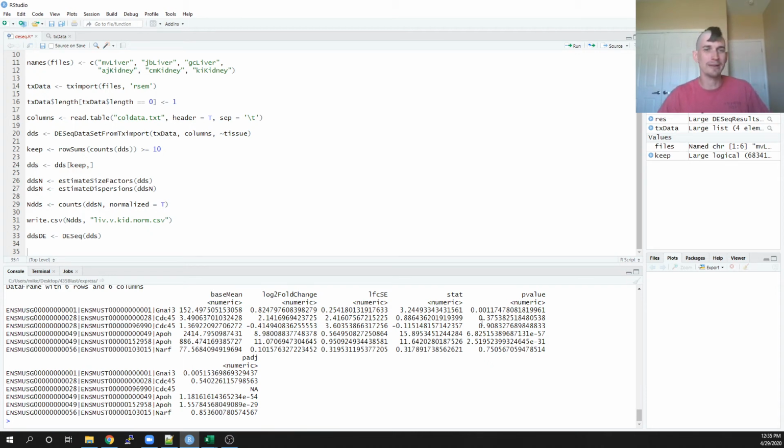So the p-value is given by this stats test, given the distribution of our expression values. If p is greater than 0.05, then there's probably a little bit of overlap, and expression is probably the same for that gene in these two tissues.